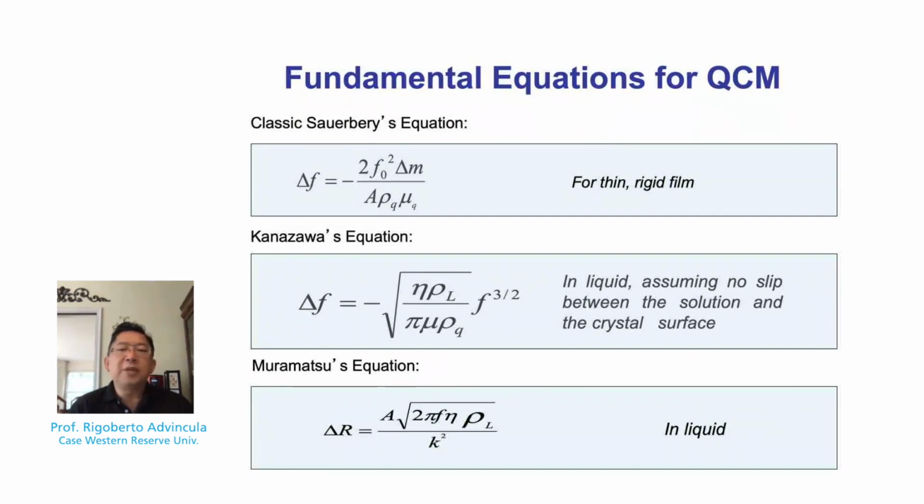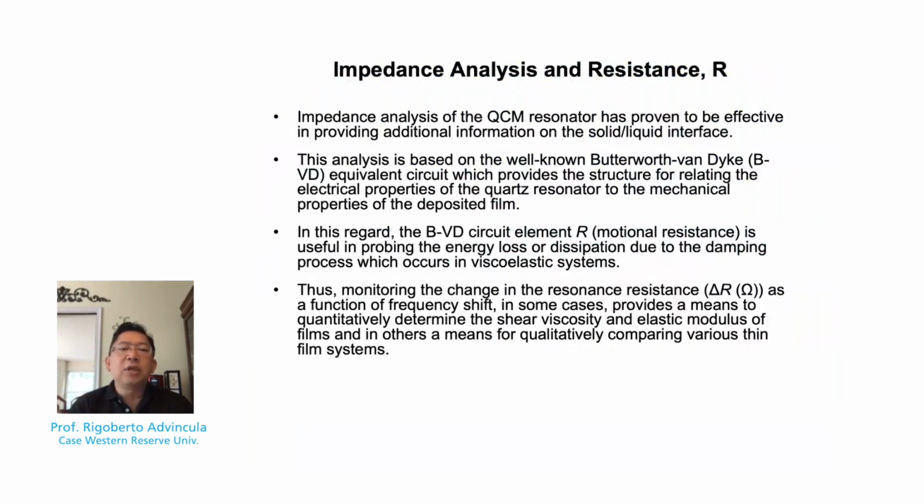So in other words, there have been attempts to modify the Sauerbrey equation when applied to liquid media. One of the well-known corrections is based on the Butterworth-Van Dyke equivalent circuit, which provides a viscoelastic description of the material deposited on the quartz crystal.